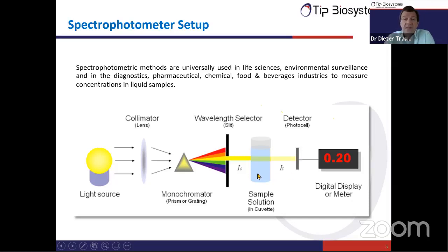But as soon as we have any substance, or it could also be particles that scatter the light, or bacteria cells, if we have some in the sample, some of the initial light intensity, which here is I0, our initial light intensity, will actually be absorbed or scattered, and therefore will not come out here and will not reach the detector. So in this case, the initial light intensity we can call 100%, and only a certain percentage of this is actually reaching the detector.